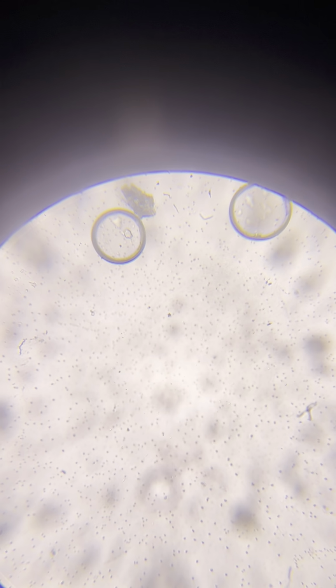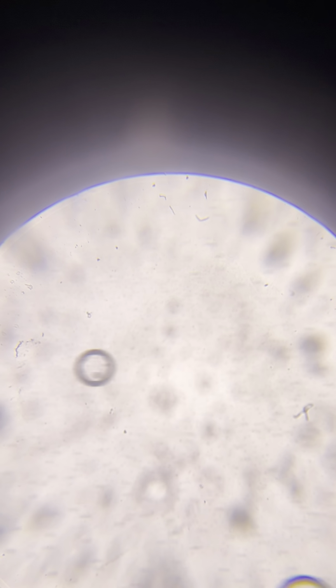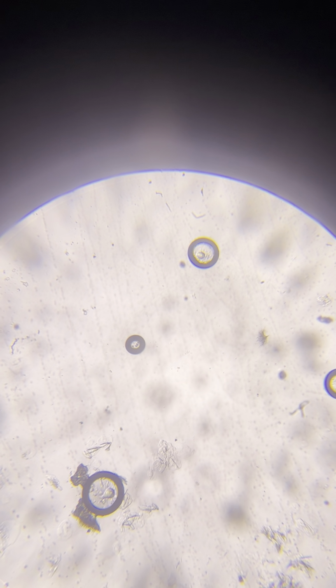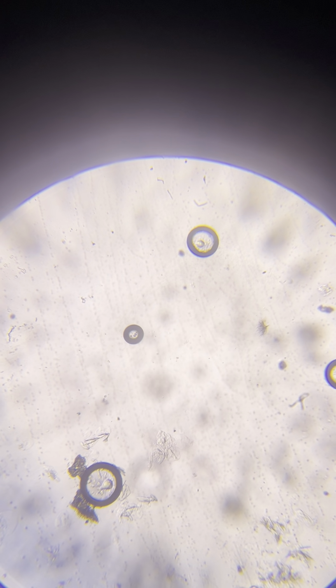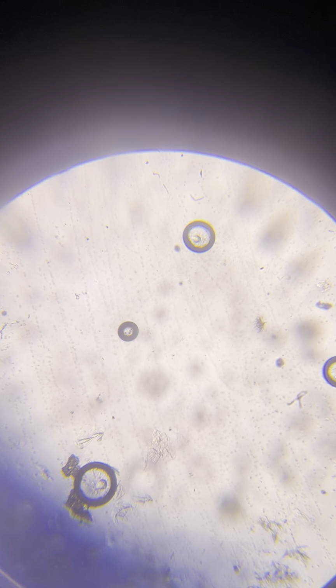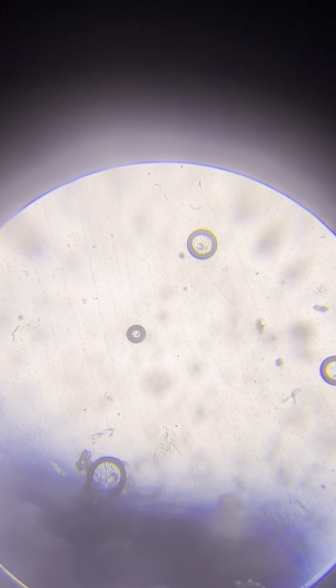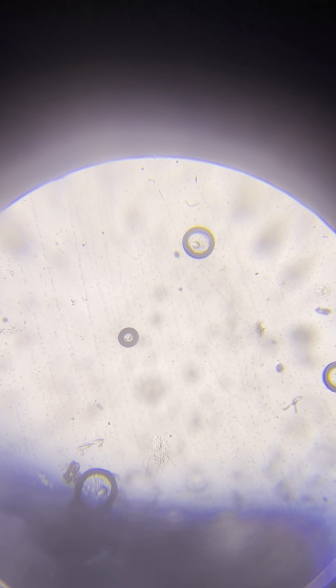Extremely beautiful ones. Wow, what a beautiful variety, and they're all in perfect circles, almost all, besides the enterprise class, the really huge ones. Those are never completely perfect circles, because they're also affected by the environment that makes them, contouring a little bit. But the smaller ones are also not always circular, and in this slide they're remarkably circular. It's very nice to watch. Okay, so this is it. Great success. I'm extremely pleased with this slide.